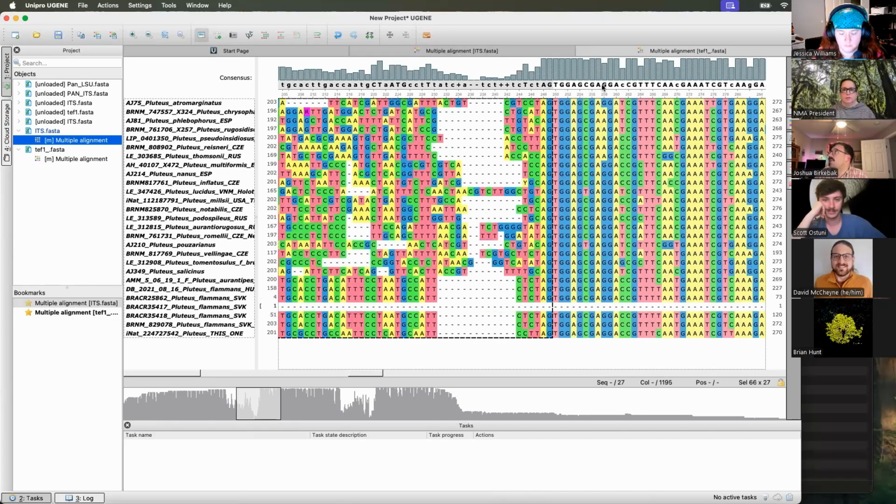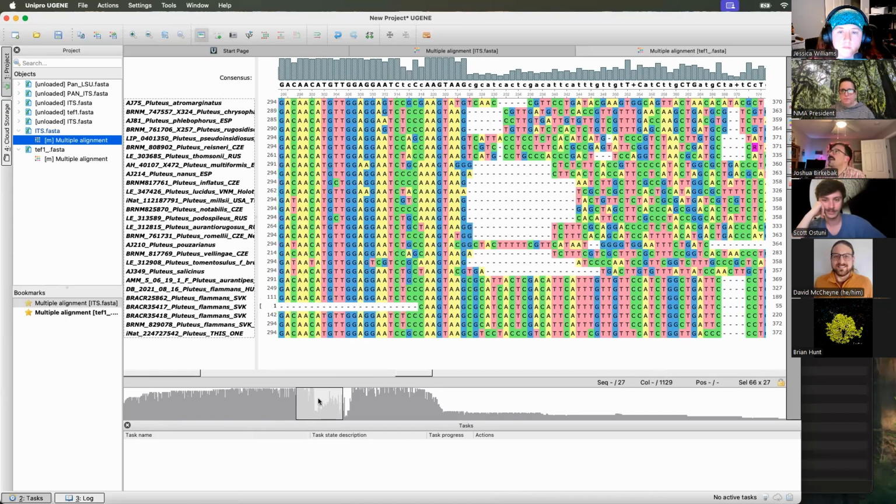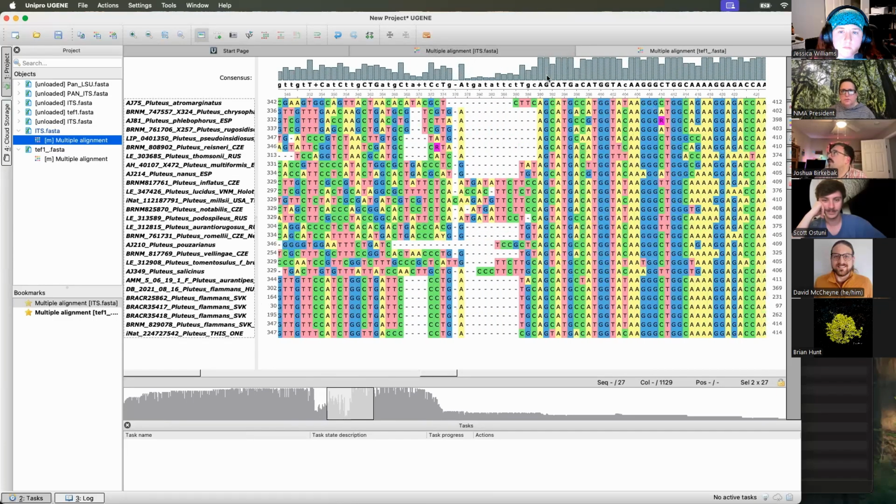And then we get back to our codon, our triplet pattern here, with very limited evolution on each flanking side of the intron often. Not always, it sort of depends. You can't really immediately see the triplet pattern because these first 3 nucleotides are all identical, but we'll literally just sit here and remove it. We'll trim it out. Same thing here. Here's our GT that we're going to start with. We're going to scroll over here to our AG, and it's pretty tidy.